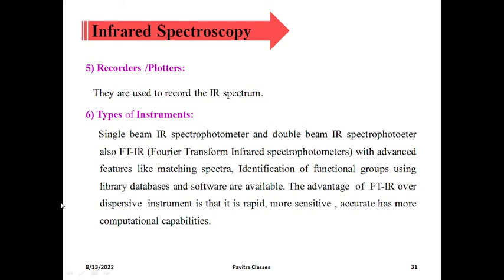Now the advantage of FTIR over the dispersive instrument. Dispersive instruments are the single beam IR spectrophotometer and the double beam IR spectrophotometer. Whereas FTIR is sophisticated, having library databases and software. It is rapid, more sensitive, accurate, and you have computational capabilities.